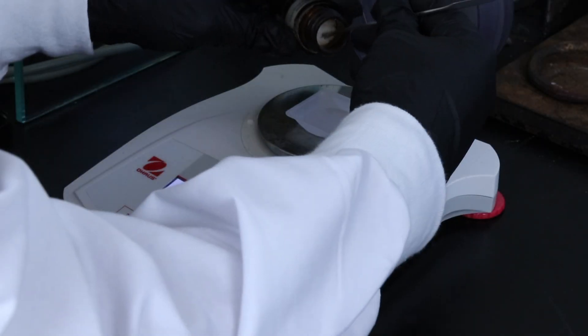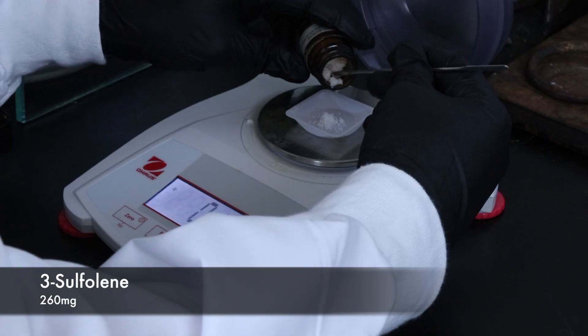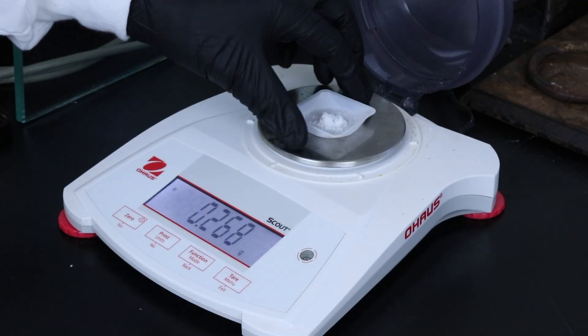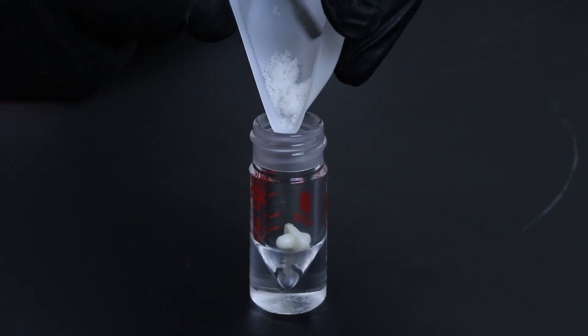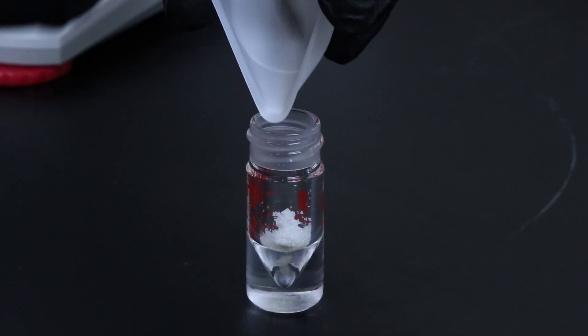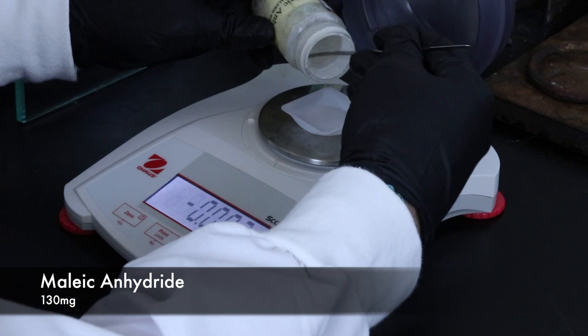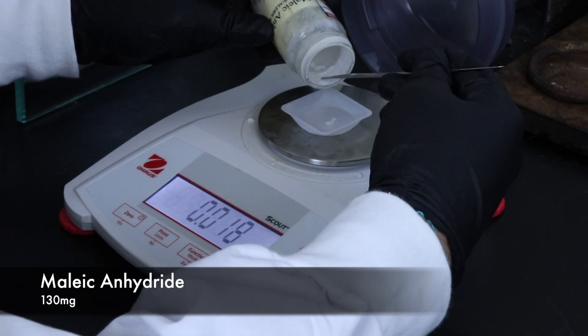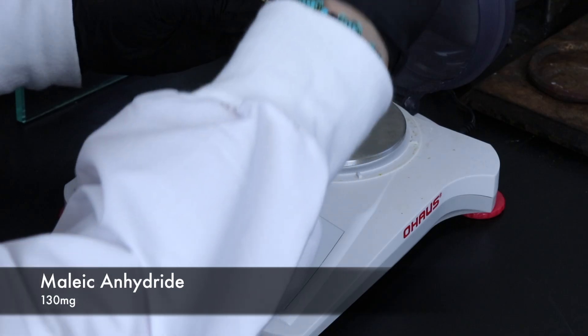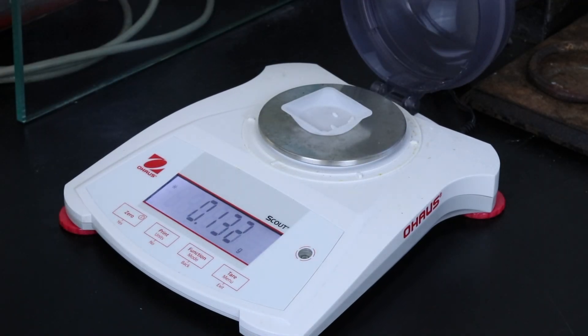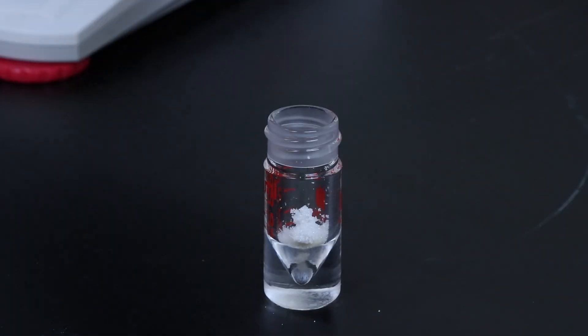I'll start by adding all of the reagents. So I'll measure about 260 milligrams of 3-sulfolene and add that to a 3 milliliter conical vial with a large spin vane. Then I can weigh out 130 milligrams of the maleic anhydride which was a little clumpy so it was kind of hard to get out, but I eventually got there and then I can add that to the conical vial as well.